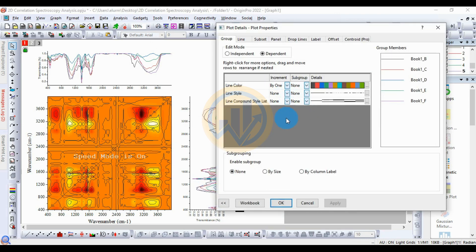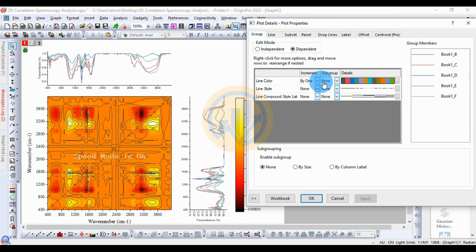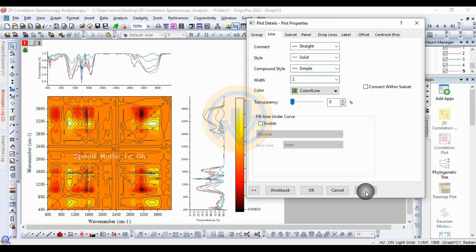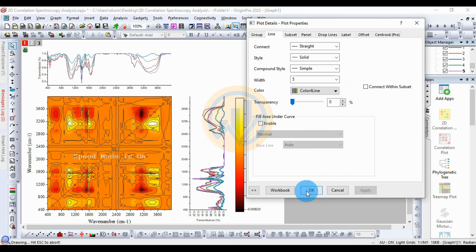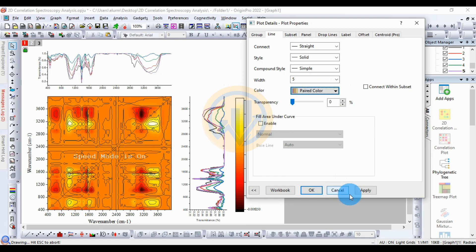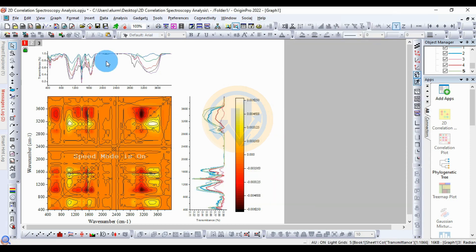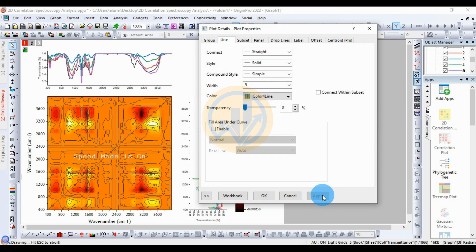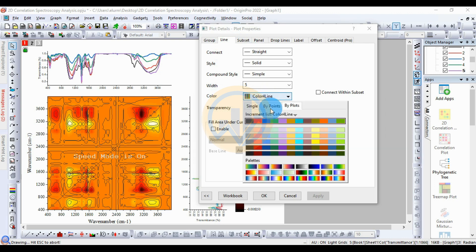Now change the line color and thickness for the FTR graph. Double-click to open the plot details. Under line color, set the group to within group, then go to the line tab. Change the line width to 2, then apply. Repeat this for all five lines. To change the color of the FTR line graph, click the color column and select a color, then click apply and OK. Repeat the same method for the next graph — double-click to open plot details, select within group, set line width to 5, then apply and change the color.